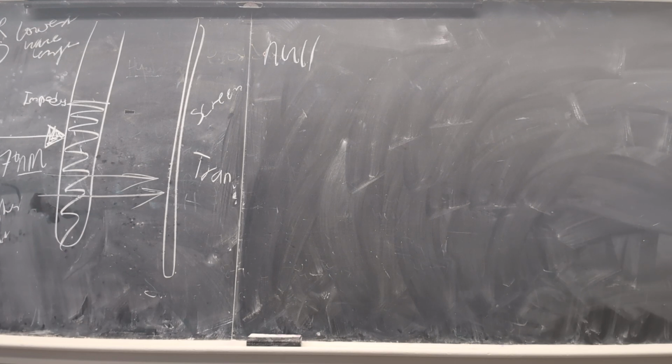Open the cap. Spin up. Keep spinning. There you go, see? But don't drop a lot, don't put everything. So drop all of this and keep just like a 0.5. Keep going. Okay, fine. Yeah, no, drop it.